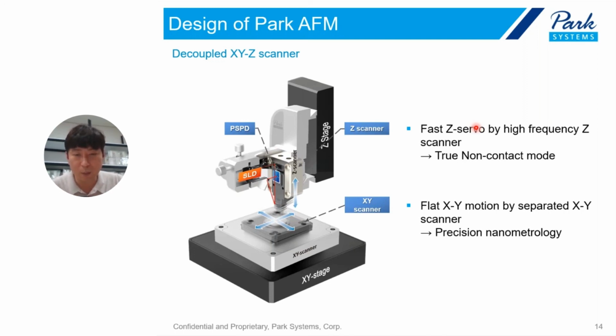Actually, using AFM, we said this is the atomic level or nanometer scale, but elemental composition is somewhat of a different story. So you have to combine some other technique, like XRD or some other chemical composition technique. So my answer is that it's a little difficult to get at.